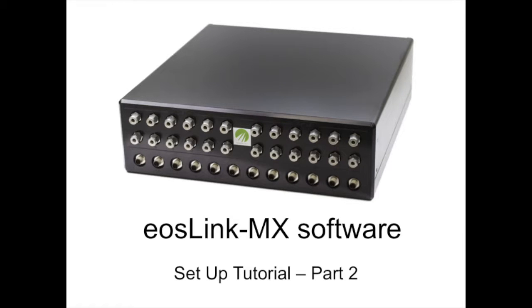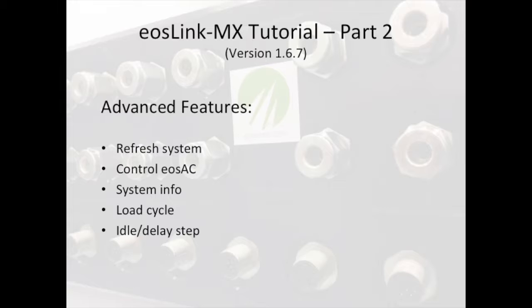Welcome to part 2 of the eosLink-MX software setup tutorial. Here we will cover some more advanced features of the software, such as refreshing the system, controlling your EOS system information, loading cycles, and the idle delay step.